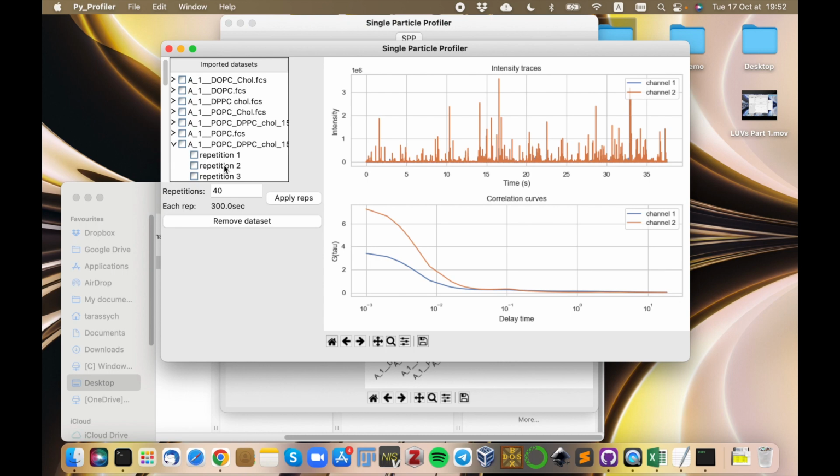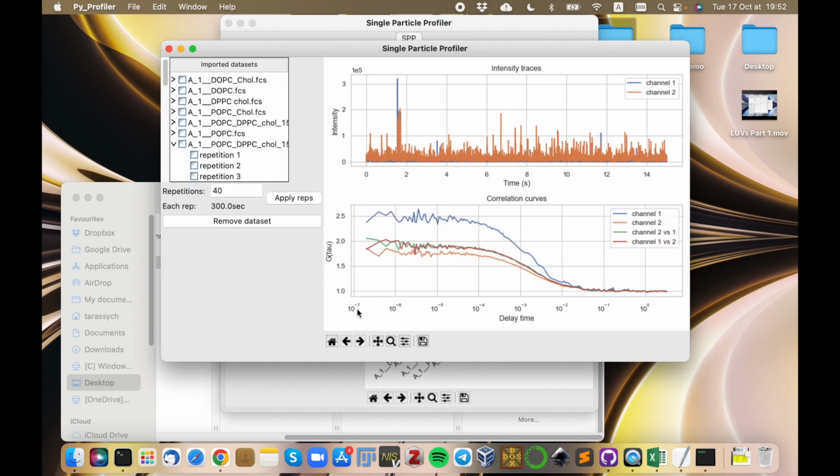And the only problem is that the new correlation function is only 10 to the minus 3, whereas here, for example, is 10 to the minus 7, because when we form these files from the microscope, those are not raw files, they are integrated, because otherwise they would be too big.